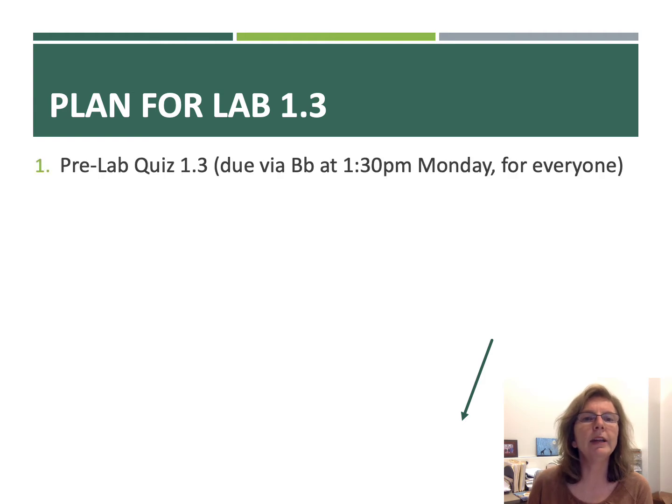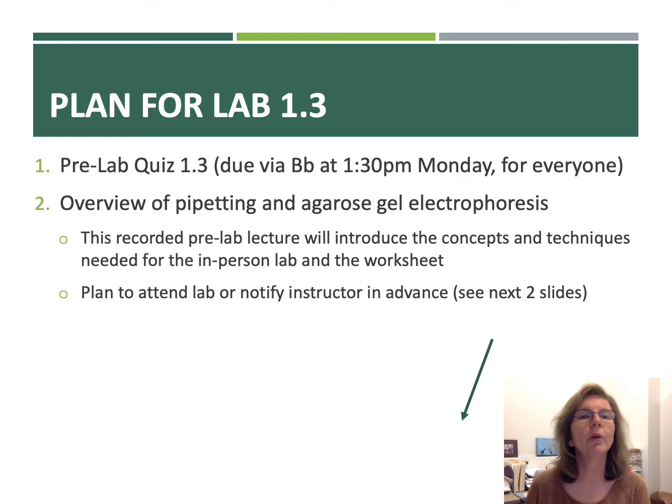Okay, so our plan is that, of course, we'll have our pre-lab quiz 1.3. This is due via Blackboard at 1:30 p.m. Monday, just like usual, for everybody. We're going to have an overview of pipetting and agarose gel electrophoresis in this recorded pre-lab lecture. And this is going to introduce the concepts and techniques that you need to know for the in-person lab and for the worksheet. You need to plan to attend lab or let me know ahead of time.